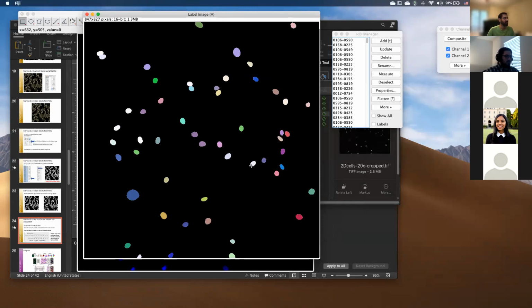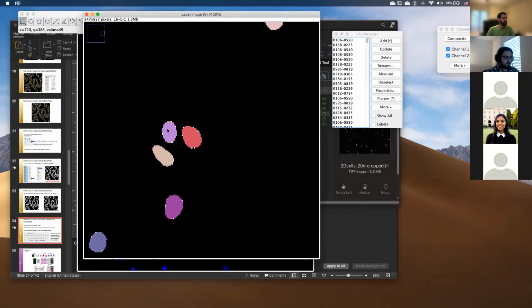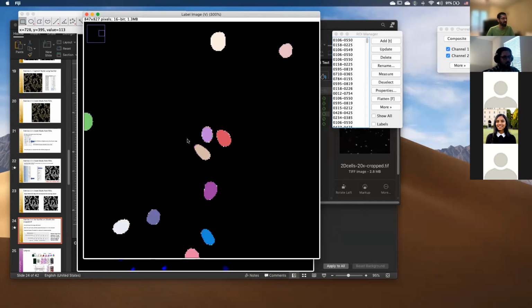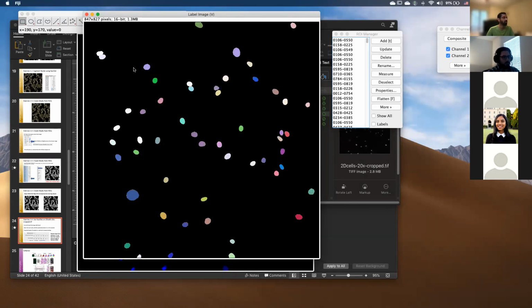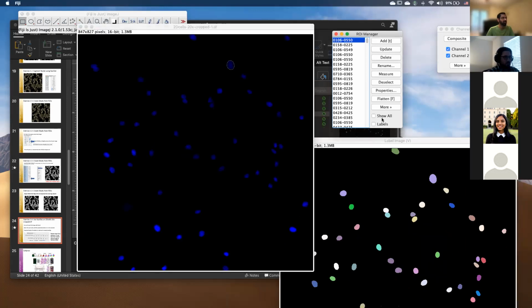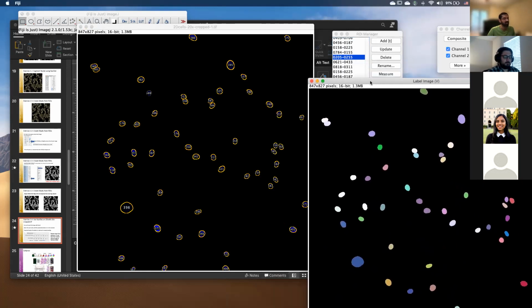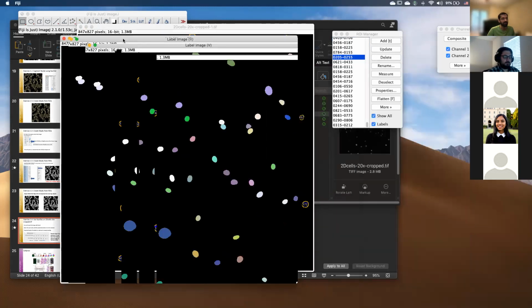It looks kind of fine over here, but if you zoom in, what you will see is there are multiple colors over here, right? Which means the same nucleus is considered as an object multiple times. And if I look at my ROI manager and show all labels, boom, we have like 400 of them. And we know we only have about 50 different nuclei, right? So this is something you need to be careful about when you are using StarDist, that you do not overinterpret the numbers.